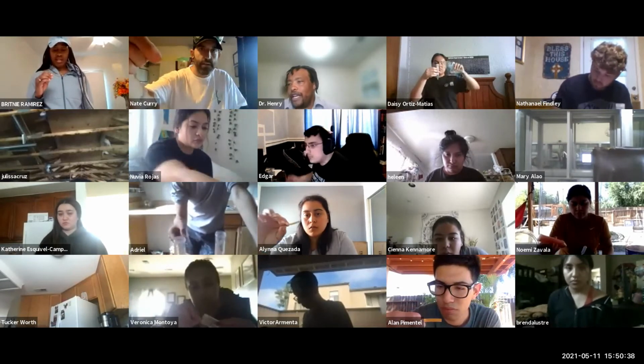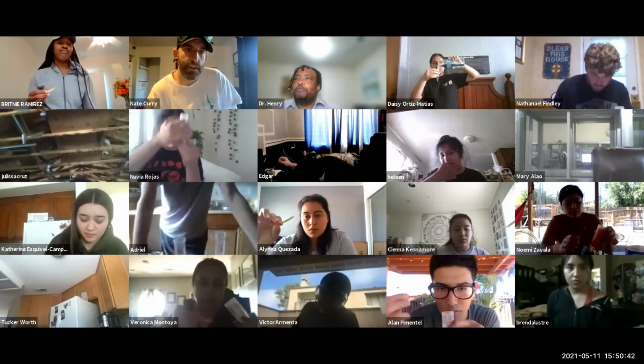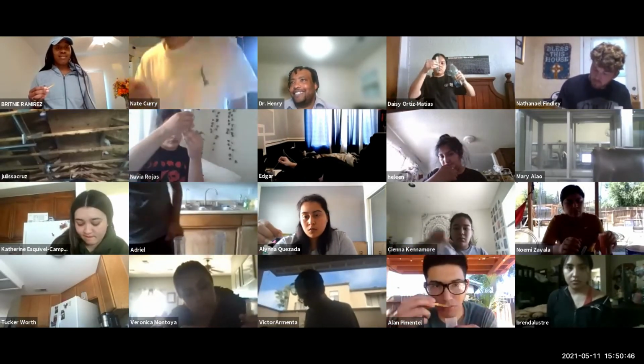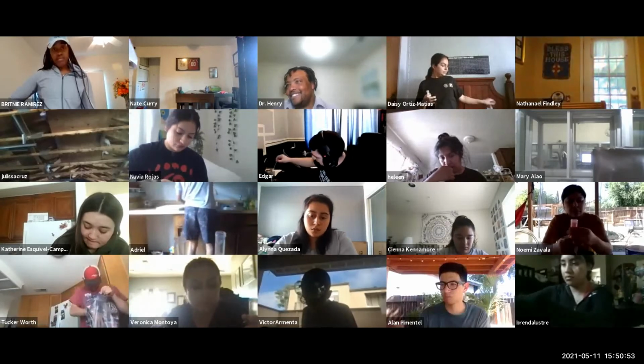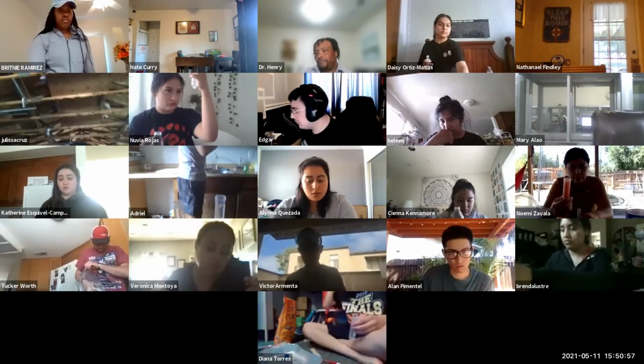Okay, what color was your Kool-Aid? Blue. Blue? Okay, do me a favor. Rinse both your strips off with a little bit of water, just a little bit. Like the part I dipped? Yeah, the part that you dipped.